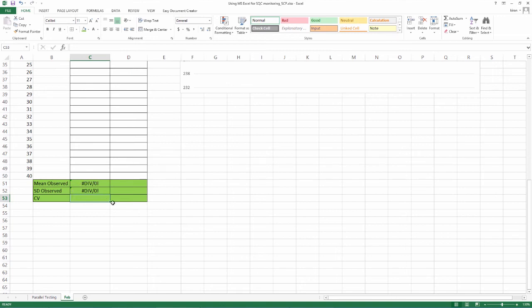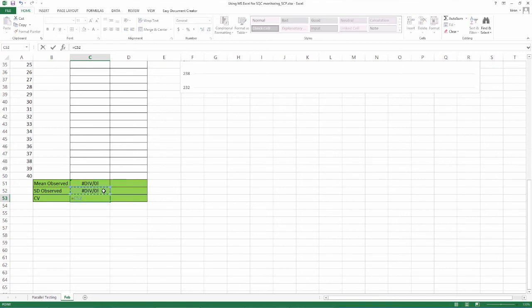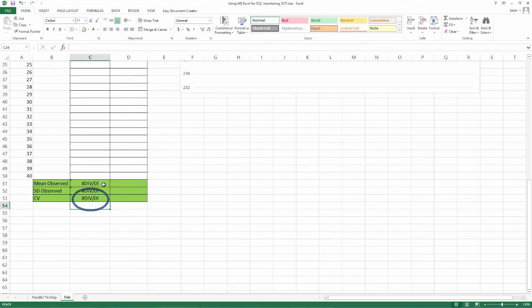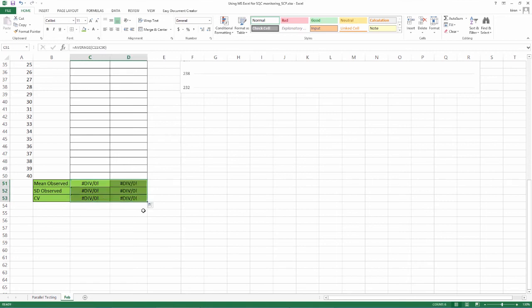Now we will go to CV. Insert equal to, click the box where we just inserted the SD formula, press forward slash for divided by, press the box where we just inserted the formula for mean, press asterisk and input 100. Press enter. Again, the hash div by 0 sign will appear as there are no current value inputs. Drag the formula for L2 also.